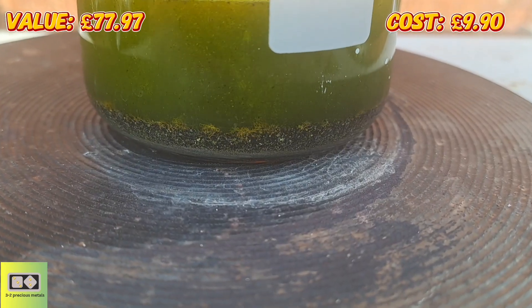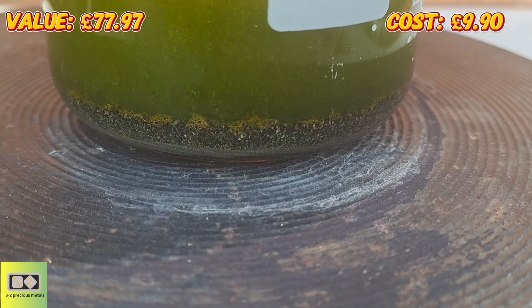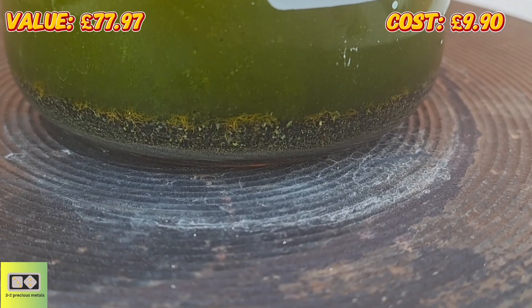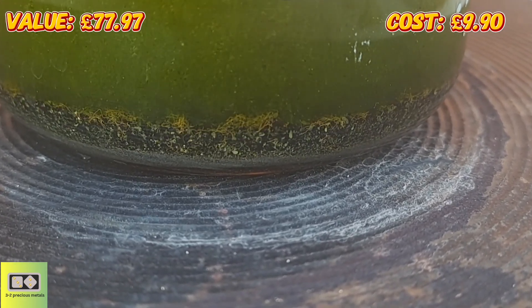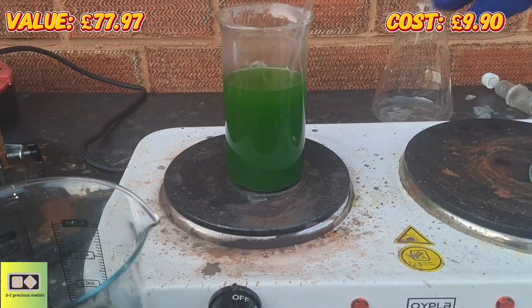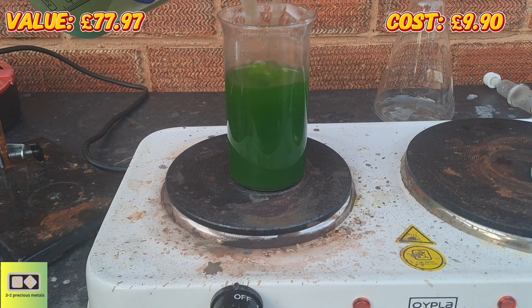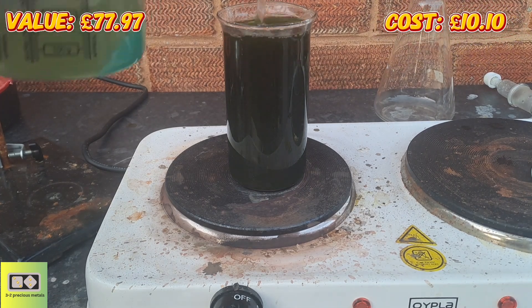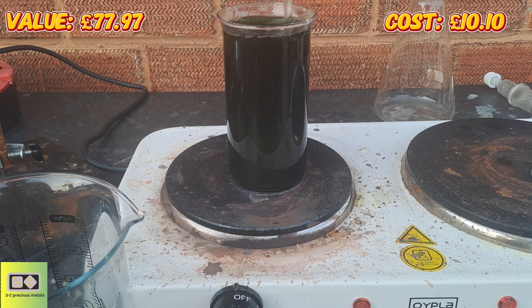I had to bring you back for this close-up — the gold dissolving looks a little bit like spiders climbing out of dirt, quite fascinating. Same as my last gold drop, I'll be using ferrous sulfate. Good reaction — I'll leave that to settle, wash it off, and then I'll get you back for the weigh-in.